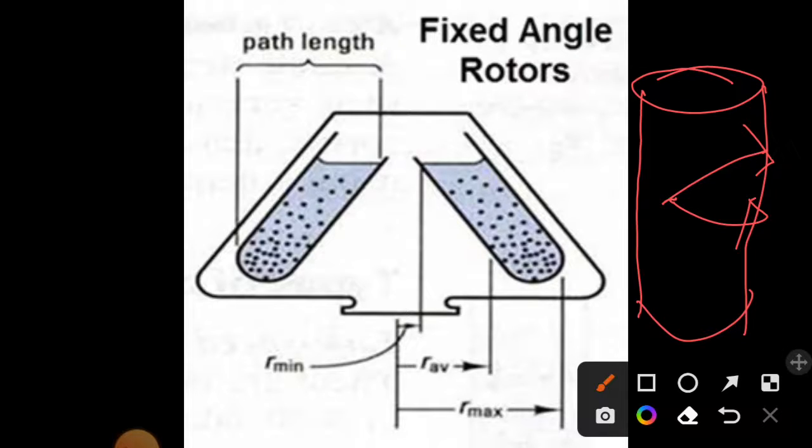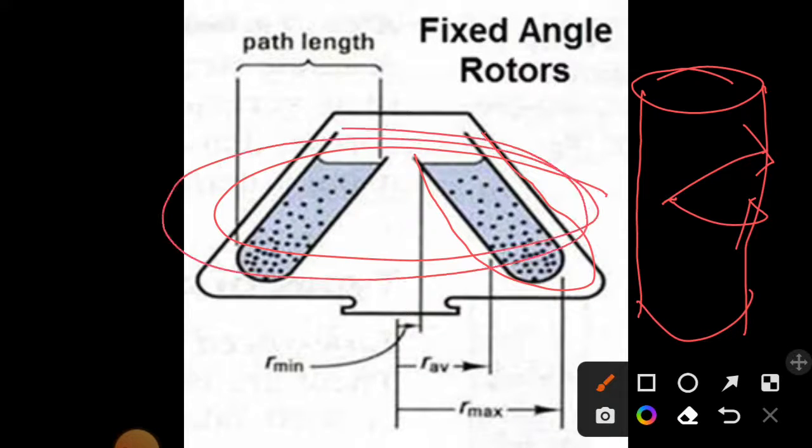Okay, as you can see, they are tilting at a certain angle, right? So during their movement the particles that are inside the tube will strike at one side. Okay, so unfortunately the side where they strike is the opposite direction of the direction of the force. Okay, so as a result, if some molecules do not slip down from that side, they remain on that side of the rotor.